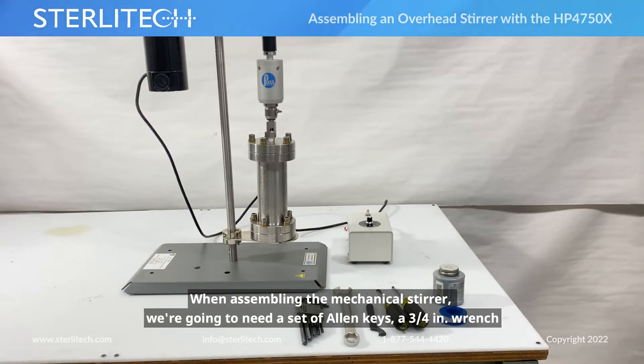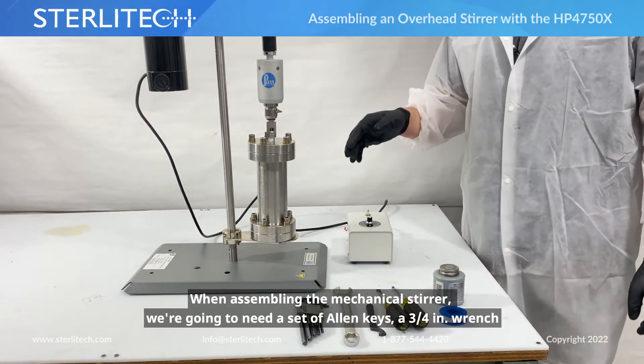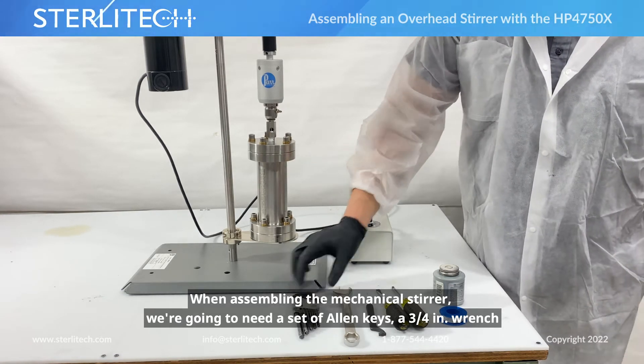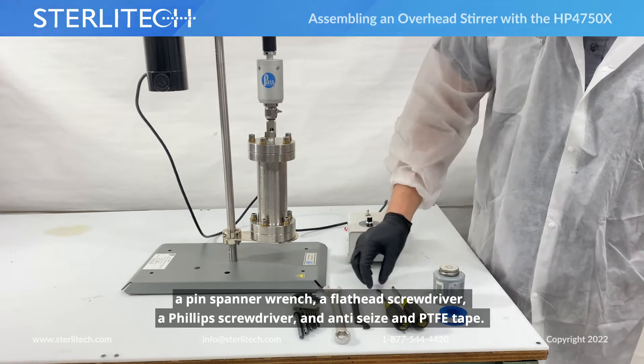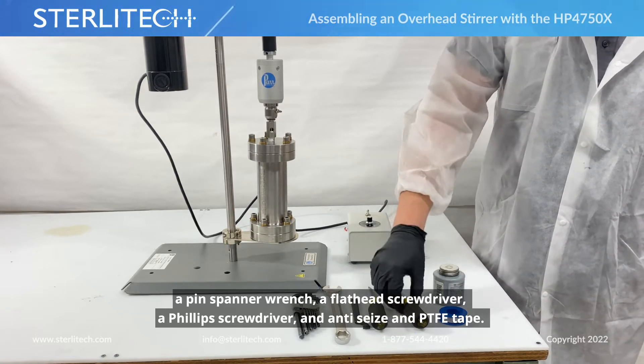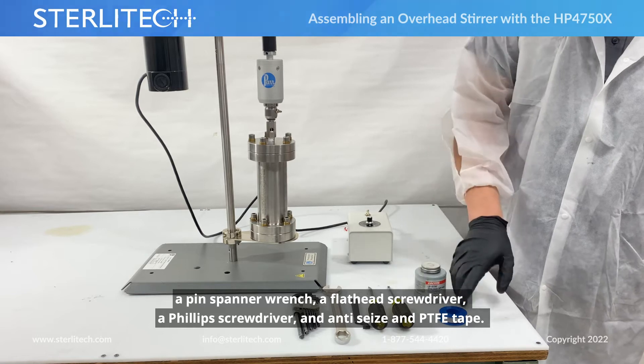When putting together our mechanical stirrer, we're going to need a set of allen keys. I'm using a three-quarter inch wrench, a pin spanner wrench, a flathead screwdriver, a Phillips screwdriver, and of course some anti-seize and some PTFE tape.